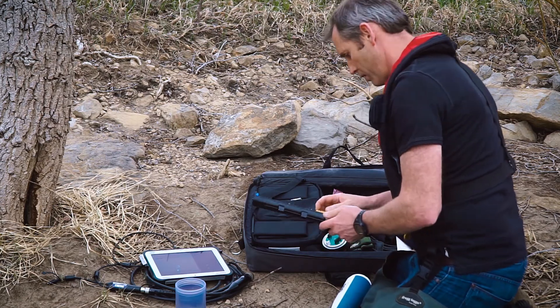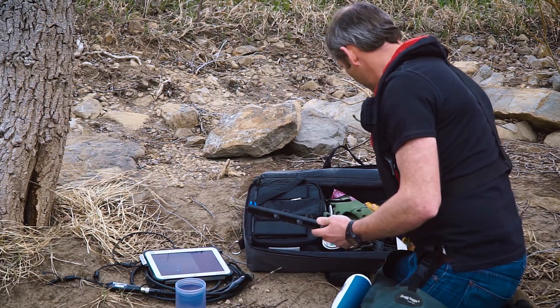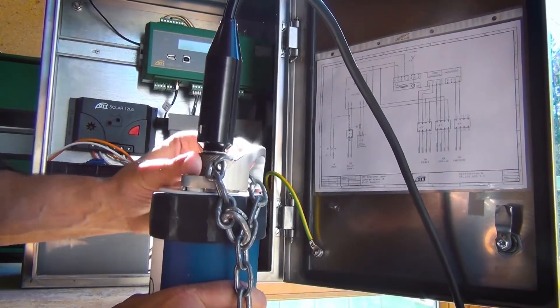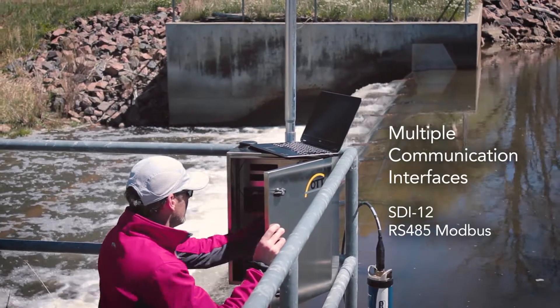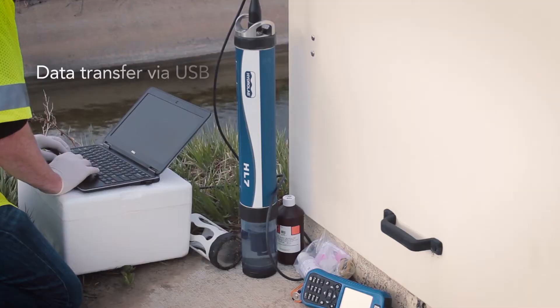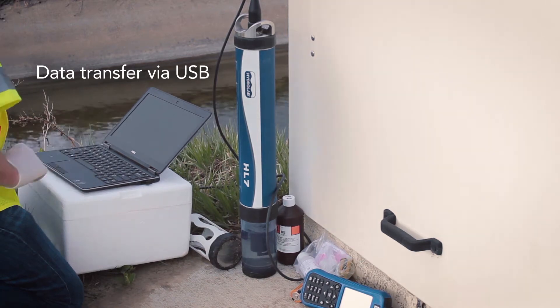The bell design aids instrument handling, providing simple and easy field use. The HL7 also offers faster integration to data loggers and data acquisition systems with multiple communication interfaces including SDI-12 and RS-485 Modbus communications and quick data transfer via USB to rugged field laptops.